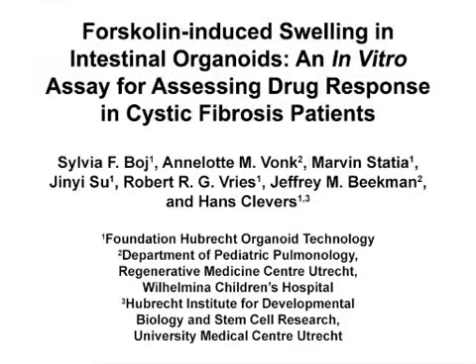The overall goal of this procedure is to assess individual CFTR function and efficacy of CFTR modulating treatments using a Forskolin-induced swelling or FIS assay in intestinal organoids generated from cystic fibrosis patients.